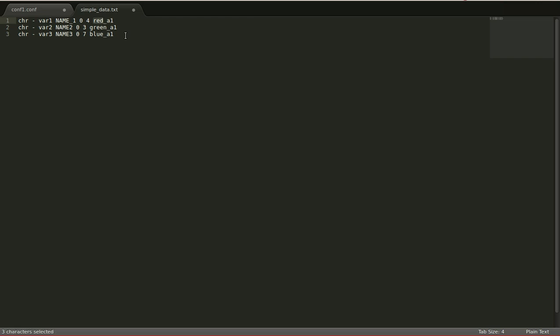So it's going to be red, and this definition of red specifies that it's going to be transparent, very transparent actually. The a stands for alpha, which means that it's going to be very transparent. When we set 1 it is very transparent, and when we set 5 it's like 50% transparent.